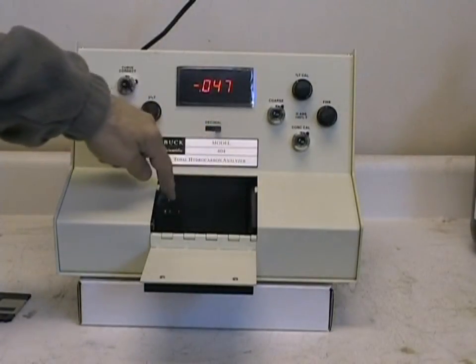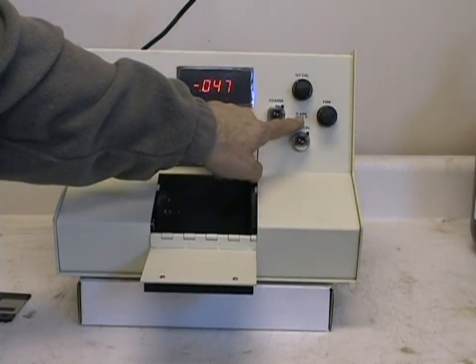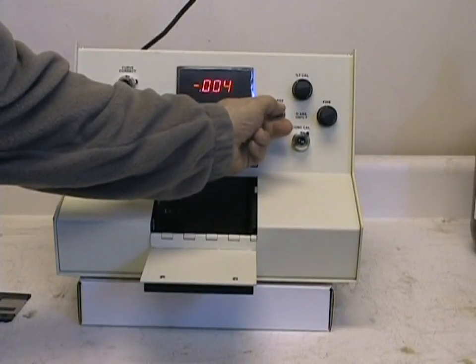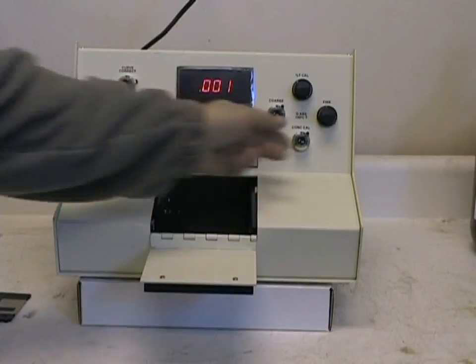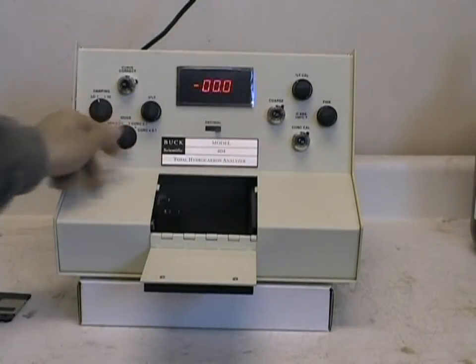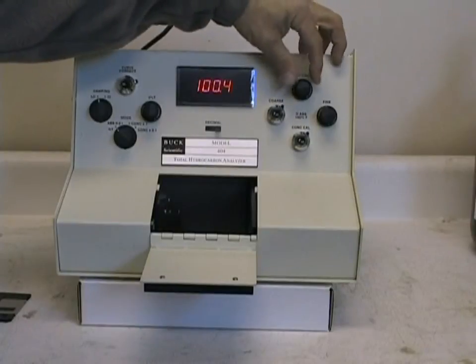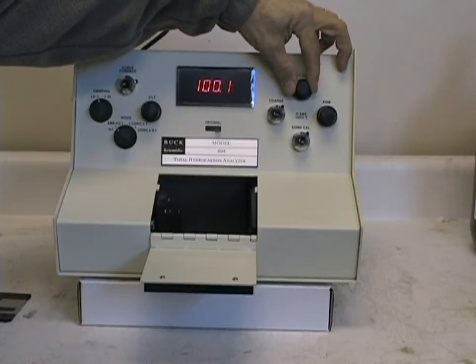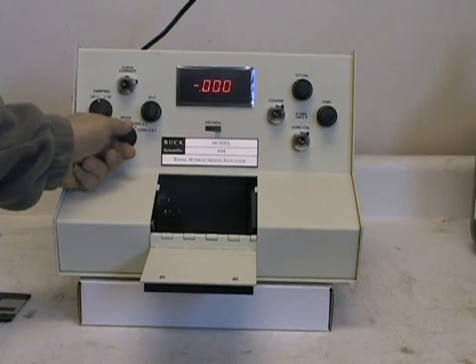Make sure the optical path of the instrument is clear and the mode switch is in the absorbance mode. Then using the zero absorbance 100% T knobs — both the coarse and fine knobs — make adjustments to the display so that it reads zero absorbance. Turn the mode knob to percent T, and if the display does not show exactly 100.0% T, use the percent T calibration knob to adjust it so that it reads exactly 100.0% T and zero absorbance.